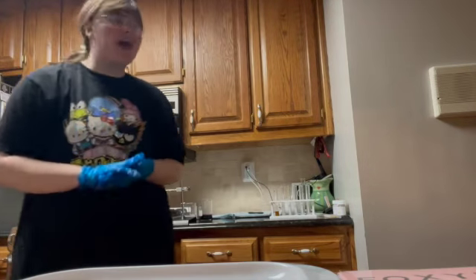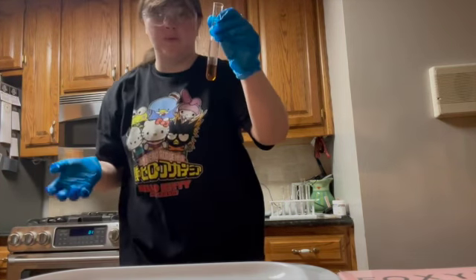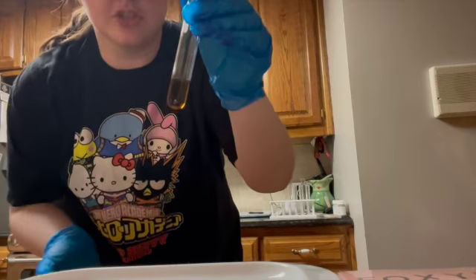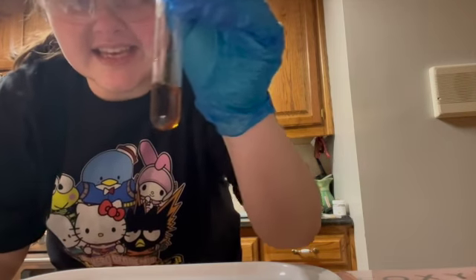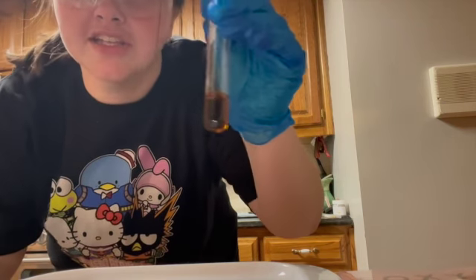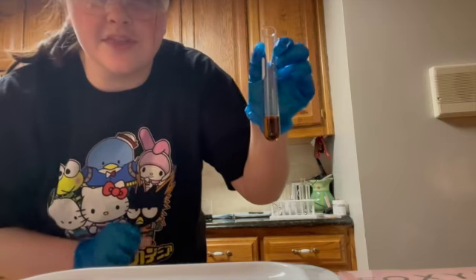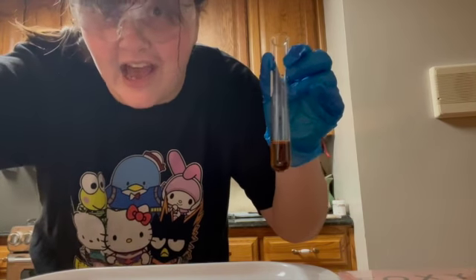Okay, hi, I'm back at the 3-minute mark. It has changed significantly. At first, it was a wine red hue, but now it's this, I can't even explain the color, this orange amber color. And this is at close to the 4-minute mark now.